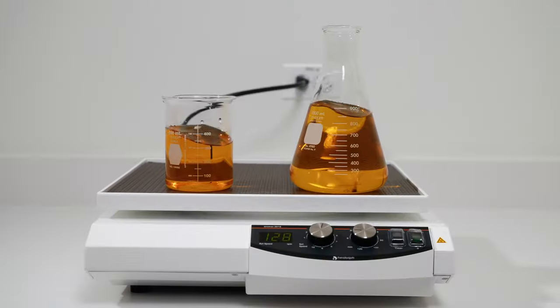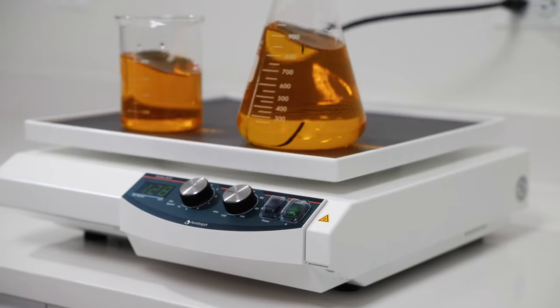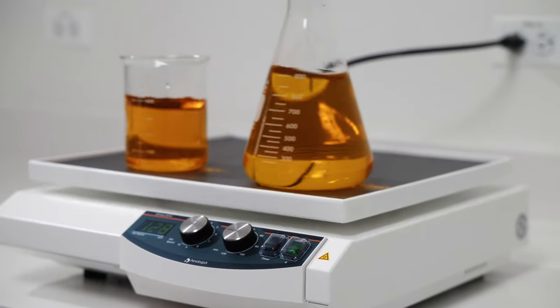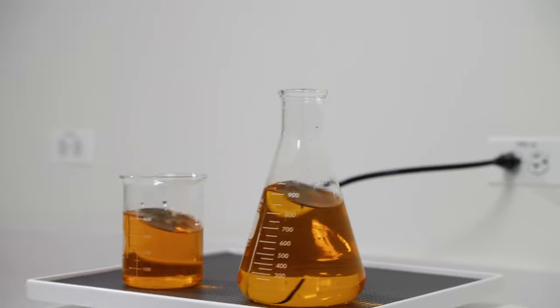First, the Unimax 2010 can sustain a max load of 10 kilograms, making it possible for multiple levels to be built on top of the same shaker. Additionally, each level has a workspace area of 390 by 340 millimeters, making it suitable for a wide range of glassware.